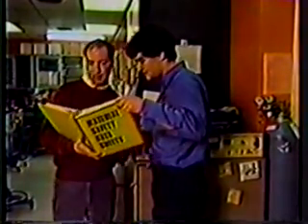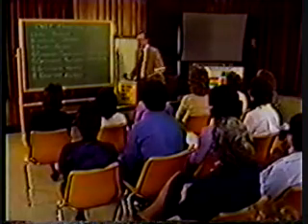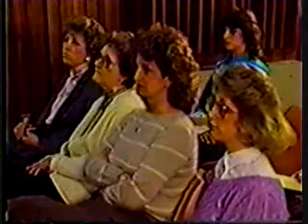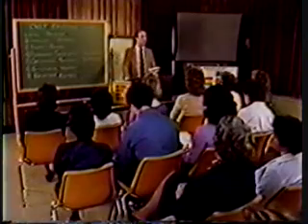That's where you come into the picture. The laboratory standard has been instituted for your benefit. It is important to ensure that your workplace is and always will be safe. After viewing this program, you should have a better understanding of the potentially hazardous substances that may be in your workplace, why they're hazardous, how you can work with them safely, and how your facility is working to ensure your health and safety.